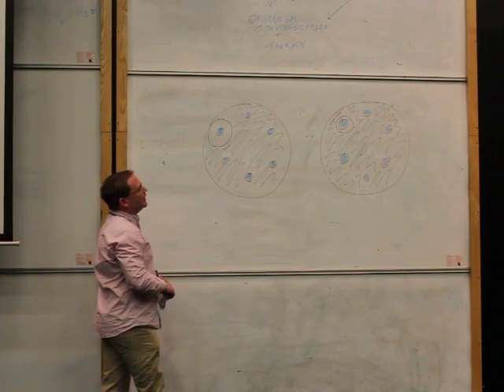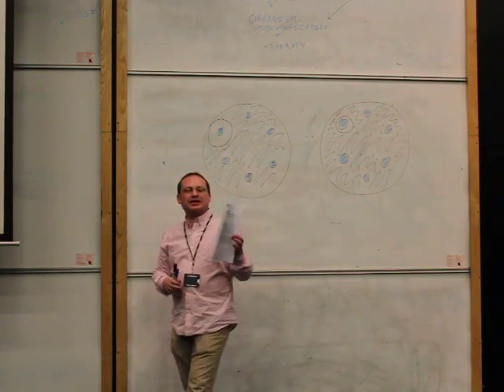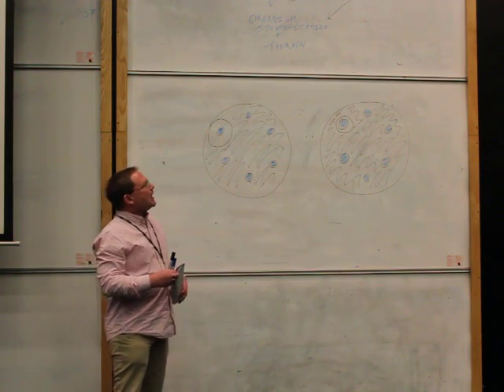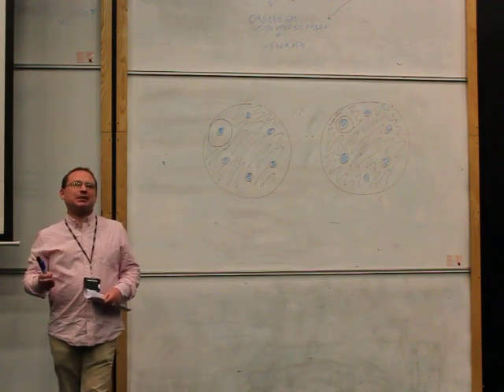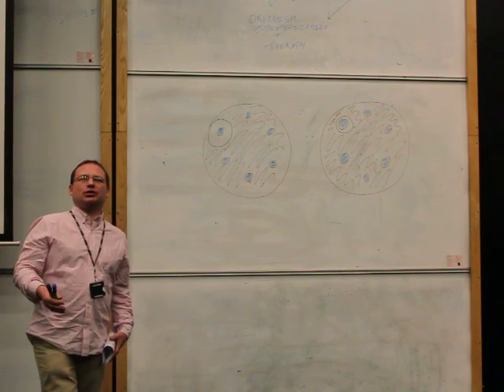Each plate, you will find, has 6 discs on. What the discs are is noted in the table in your handout. And what you will need to do is compare zone sizes of inhibition of a test organism against that of a control organism.